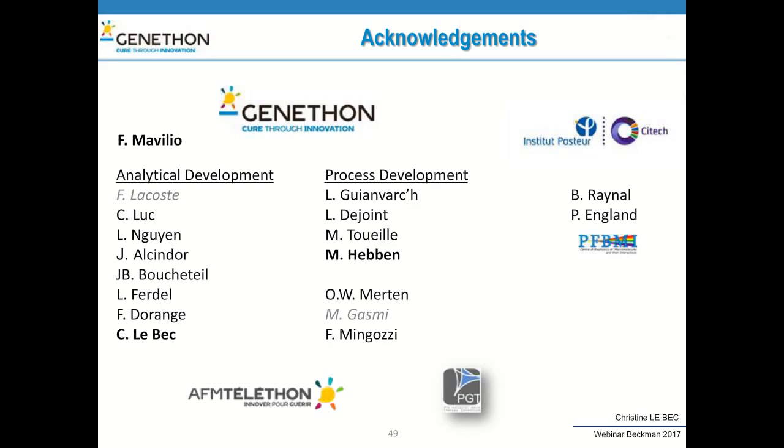Right now, we make some qualification of the method. As I presented, we made some repeatability tests just to demonstrate the repeatability and the linear range of the signal. For a full validation of this method for quality control of cGMP lots as a release testing, we would have to validate the software, and so far, that is really difficult. The software has been developed by an academic university, and we don't plan to use this for release testing of GMP lots. But I heard some people try to do this, actually.